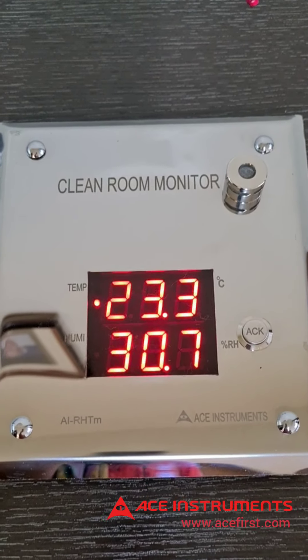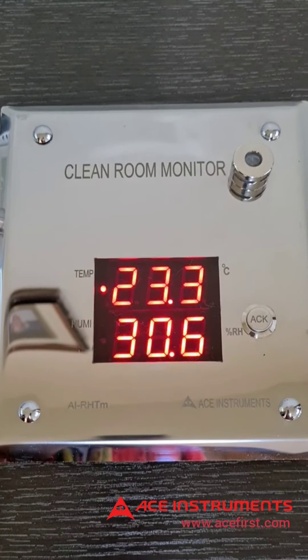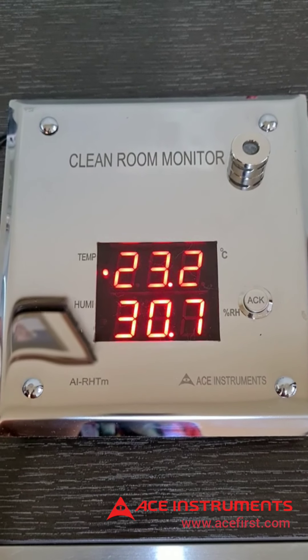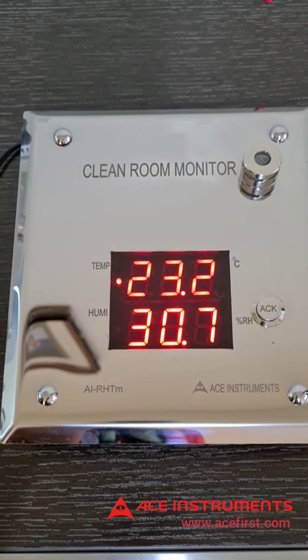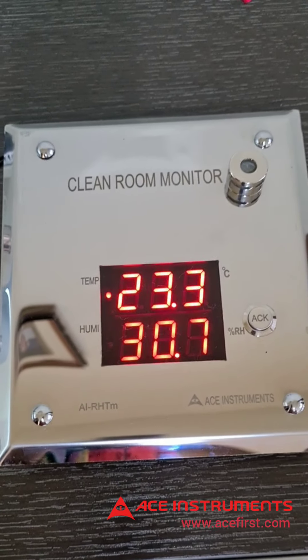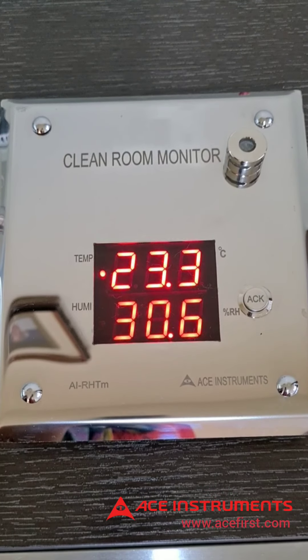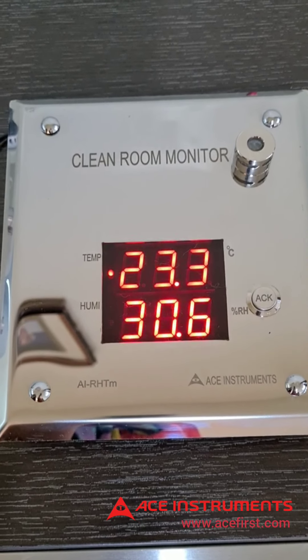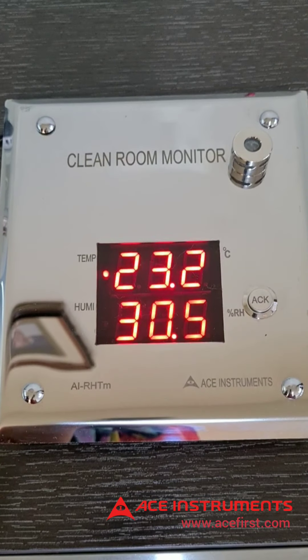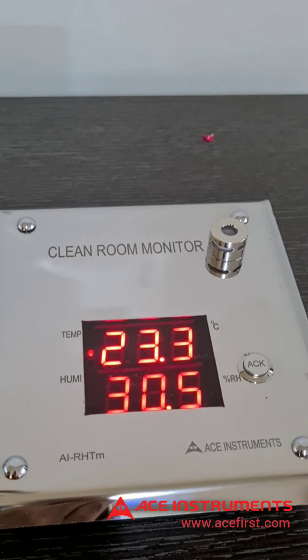Optionally, the instrument is also available with degrees Fahrenheit as the engineering unit for temperature measurement. The humidity temperature monitor measures temperature in the range of 0.0 to 60.0 degrees Celsius and humidity in the range of 0.0 to 99.9 percent RH.